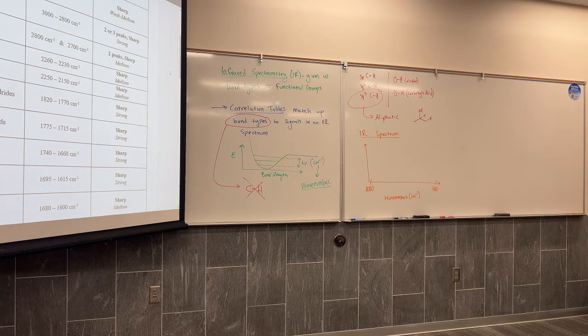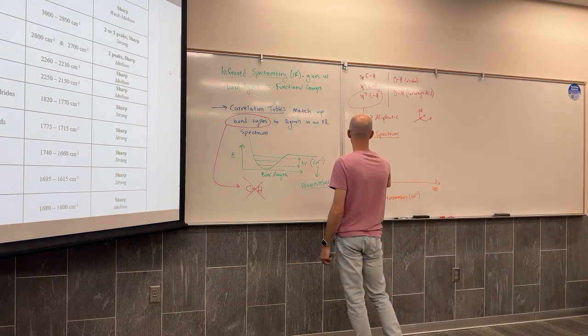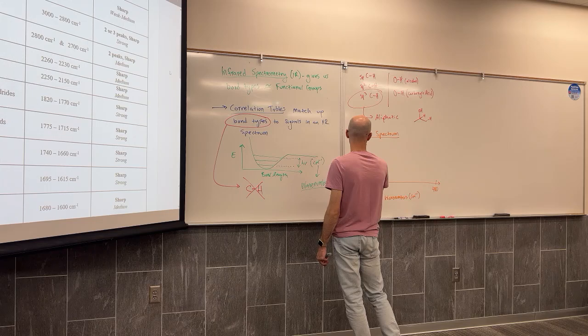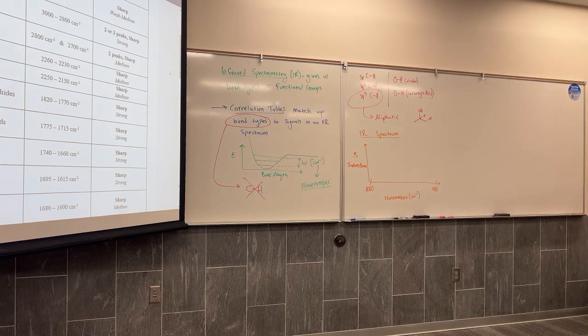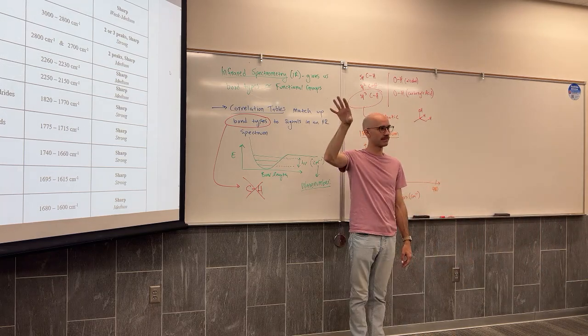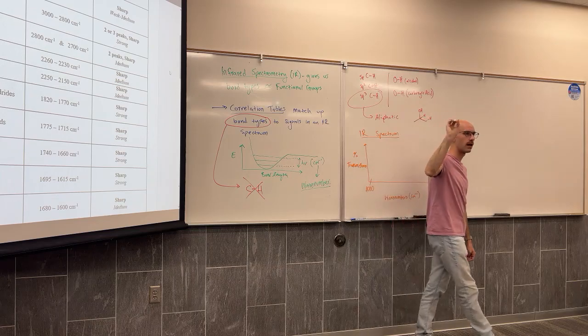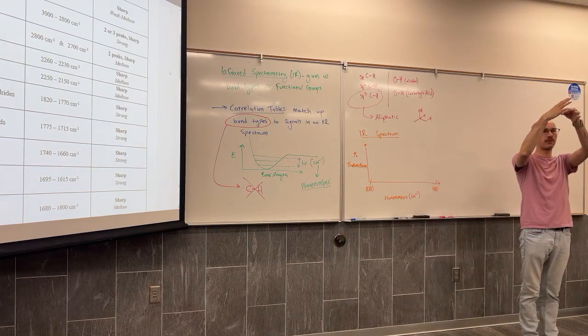On the y-axis, we look at percent transmittance. What does that mean? Okay, our instrument, well, there are different ways that this instrument can be set up as well. Most instruments will shoot light out of a source. It goes up and it hits the sample.